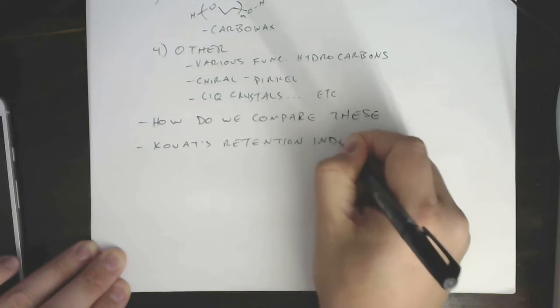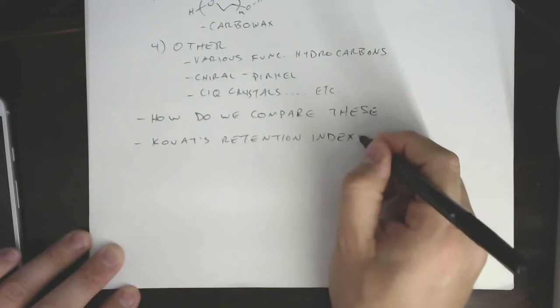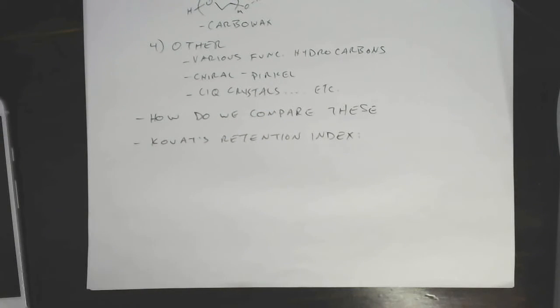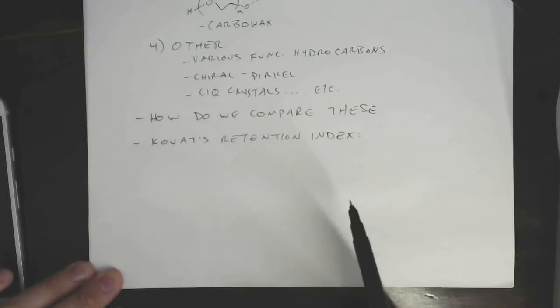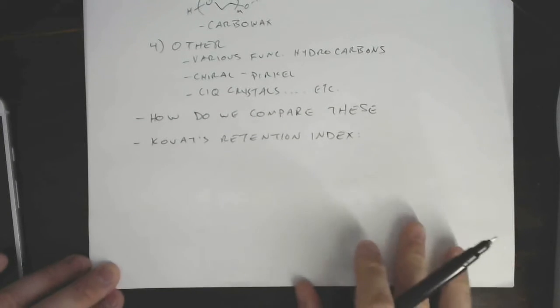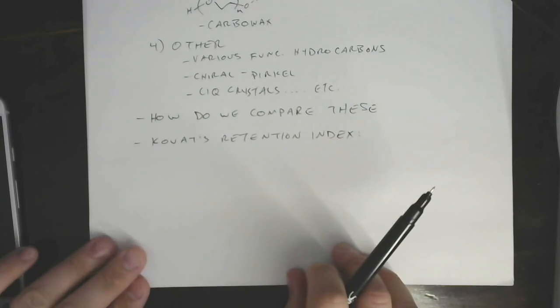So in general, a retention index, there's lots of these. You'll find lots of different things classified as retention indices. A retention index is an approach to describe the retention of analytes or model molecules on a column in a way that is normalized for variables that change from lab to lab, right? Some way to universalize how things are retained on a column. You see them all over LC as well. It turns out this one has been an extremely useful and widely adopted retention index used in GC, and so it's the only retention index we're going to talk about. We'll see a little bit later why retention indices are a little harder to do in LC.